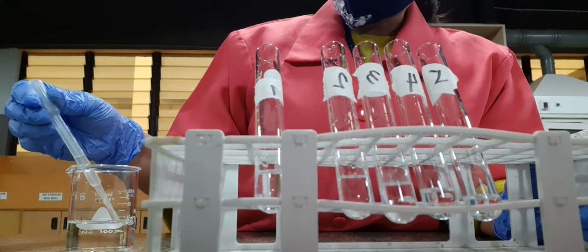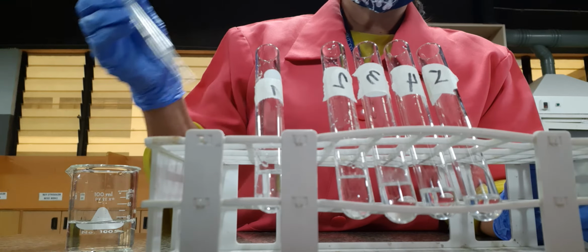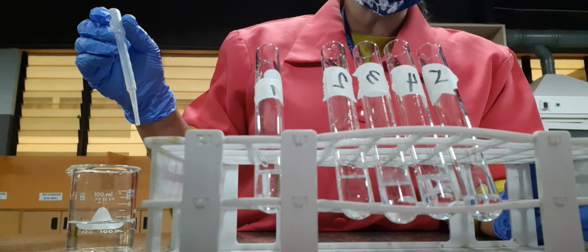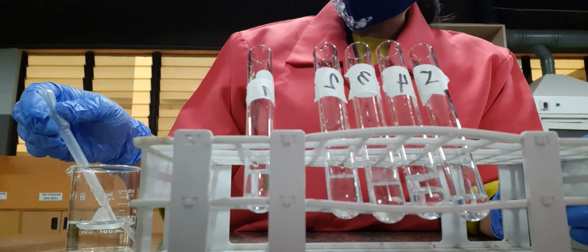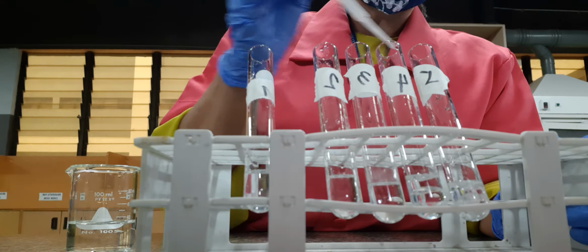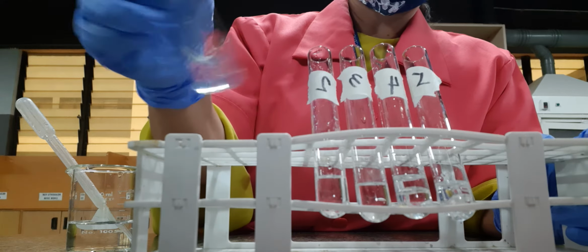And then we have benzaldehyde and water. Take note of that. What happened? We will shake that one later. And then we have acetophenone and water. Okay, so take a look.